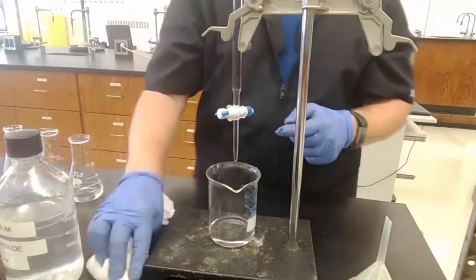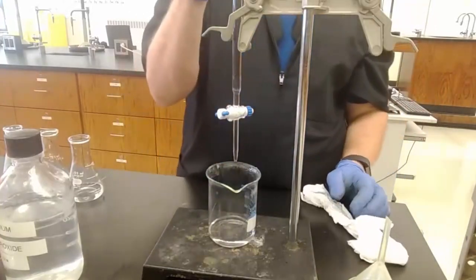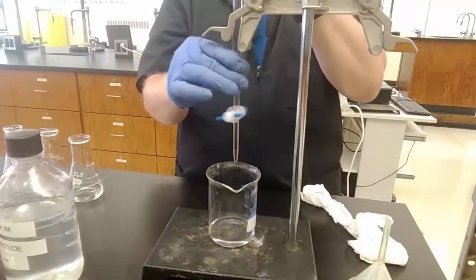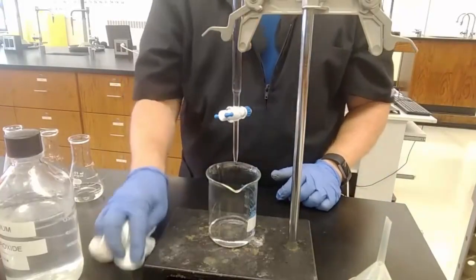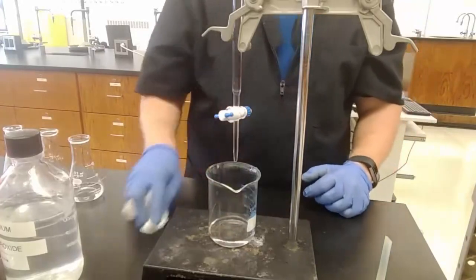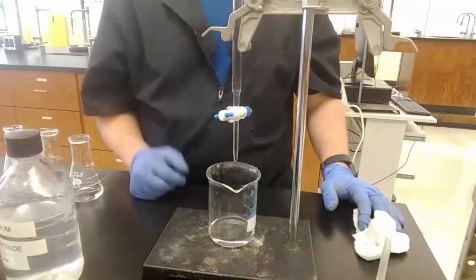The burette, like that pipette before, is a very, very precise measuring device. This is to deliver at 20 degrees Celsius. I'm looking for a plus minus on it. It doesn't have one, but it's usually like 0.02 of a milliliter. Since it reads in 0.1s of a milliliter, and you're guessing that last digit, it's pretty much plus or minus 0.02 or 0.03 milliliters. Very precise volume measuring.